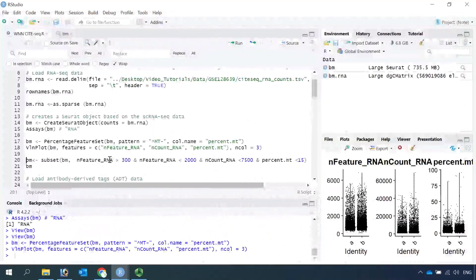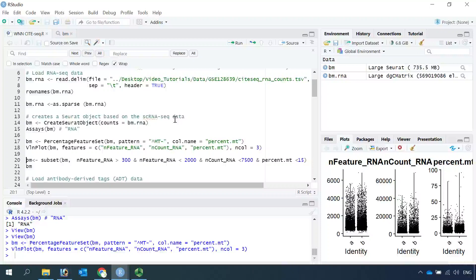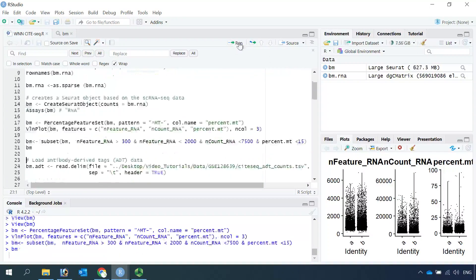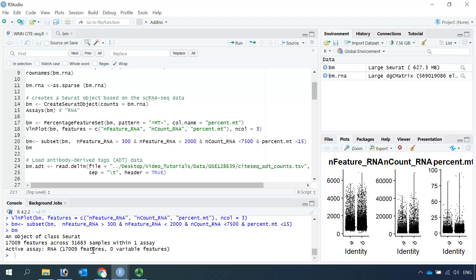So we can use those parameters to subset the cells and perform quality control. Now if we look at the object again, you can see we only have 31,683 cells.